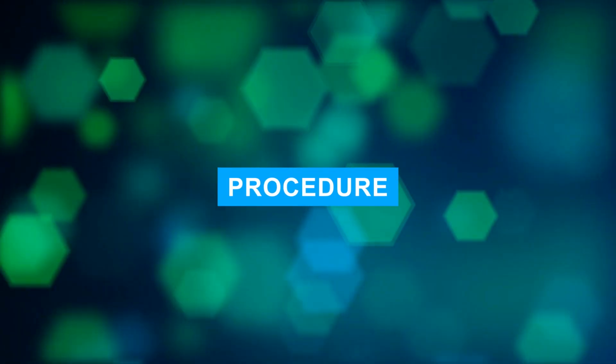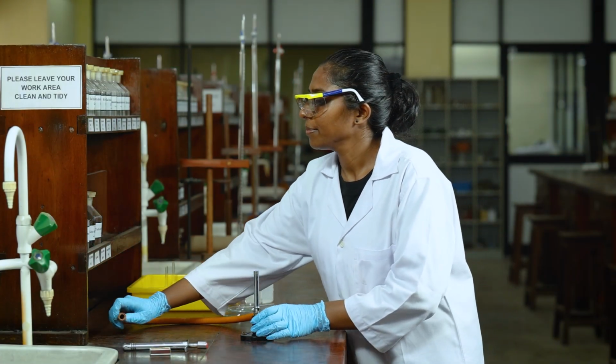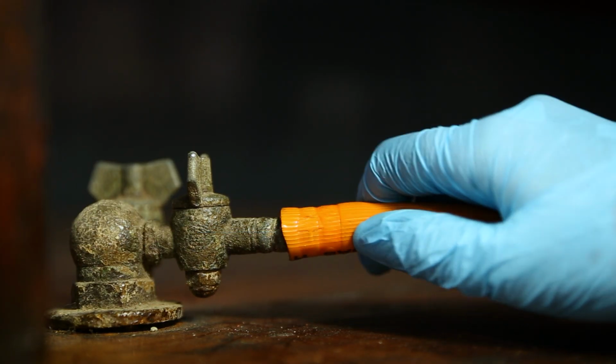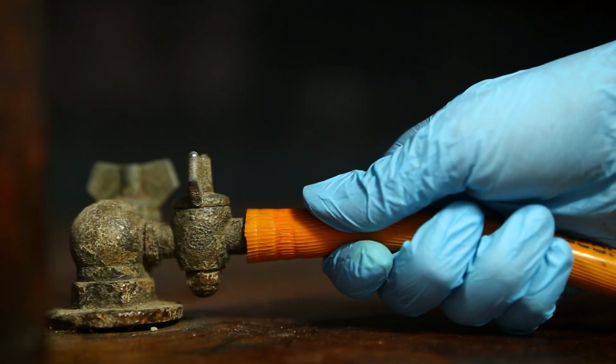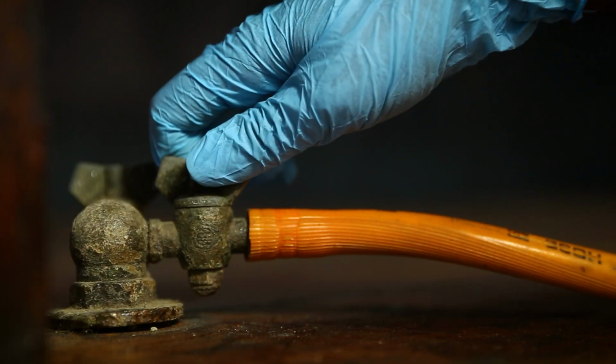Now we are going to start the flame test experiment. The first step is that you need to light up the Bunsen burner. First, connect the hose that is connected to the Bunsen burner to the gas line from the other end. Then, check whether it is firmly attached. Only after that, line up the gas tap with the hose to open the gas line.